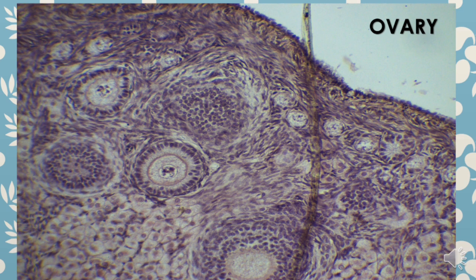Now the stroma. In the high magnification you can see the stroma cells surrounding the follicle cells, now differentiated into the theca interna layer, which is located adjacent to the granulosa cells.